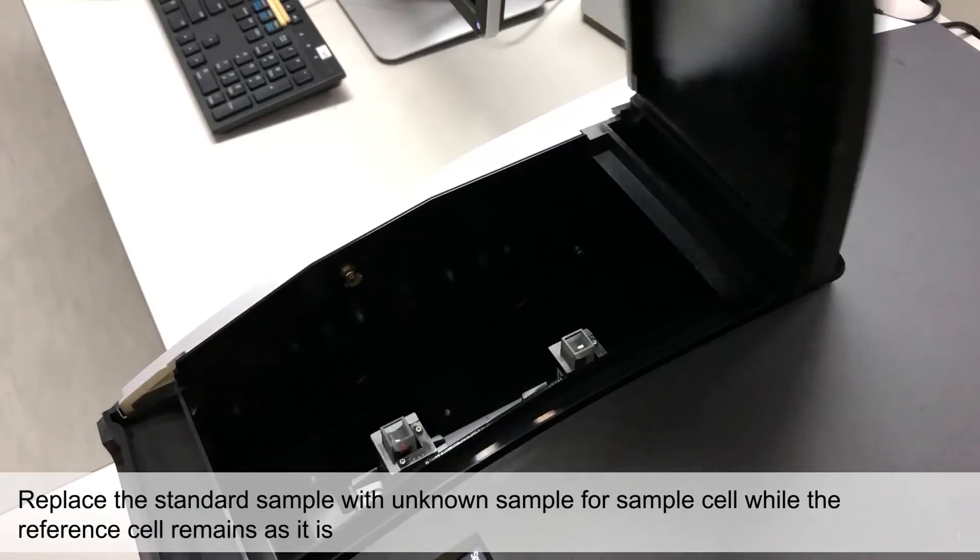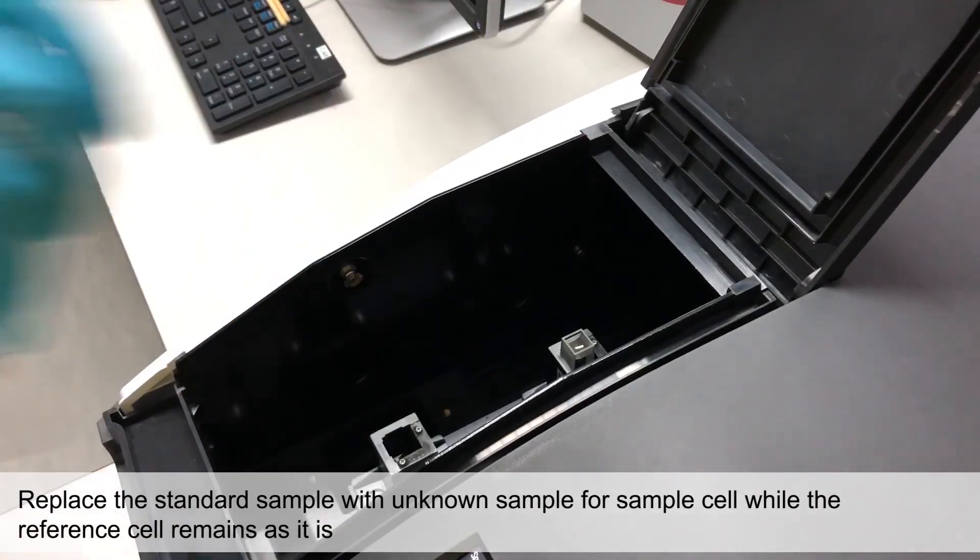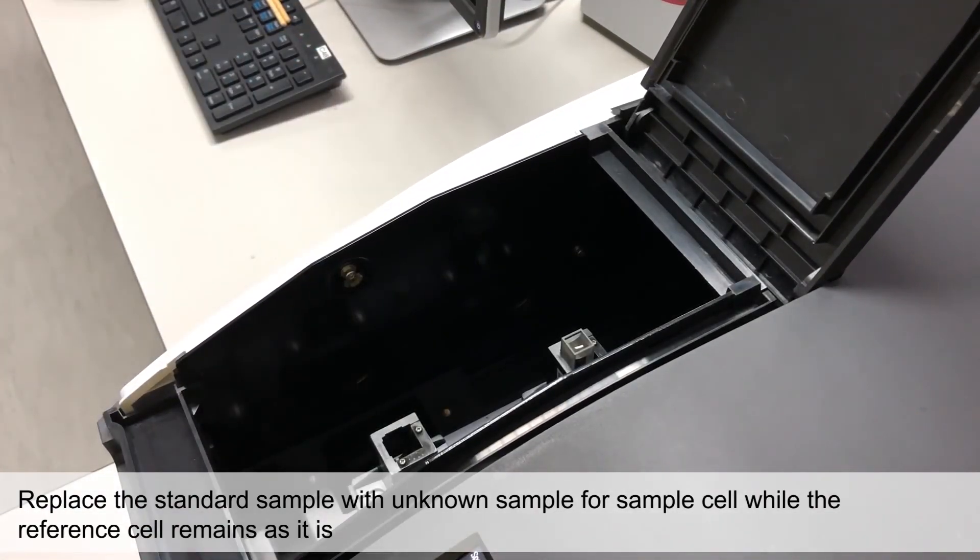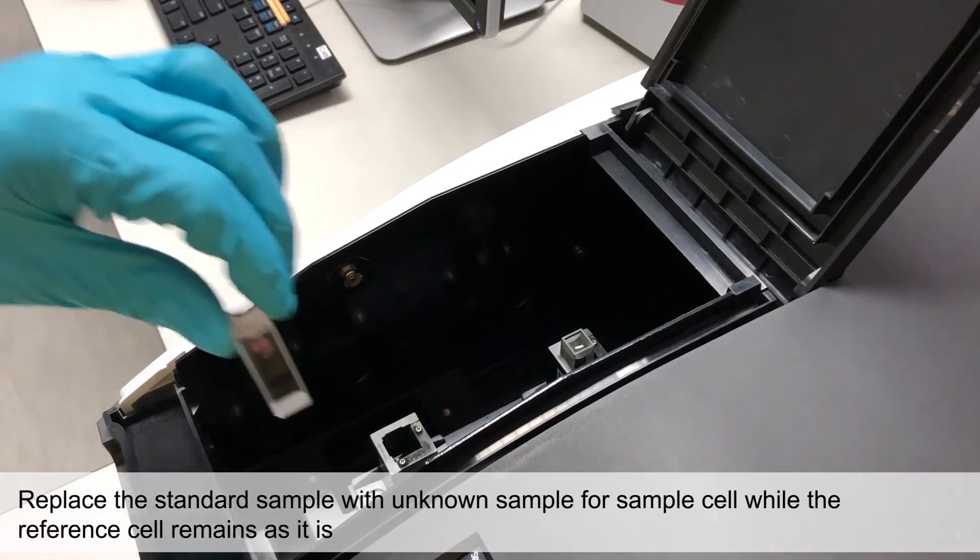Next, replace the Standard Sample with the Unknown Sample for the sample cell. The cuvette in the reference cell remains as it is.